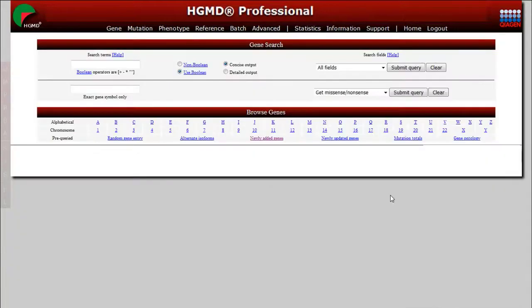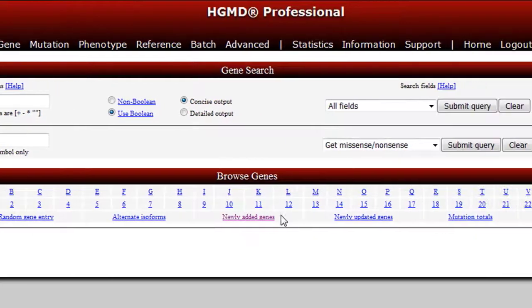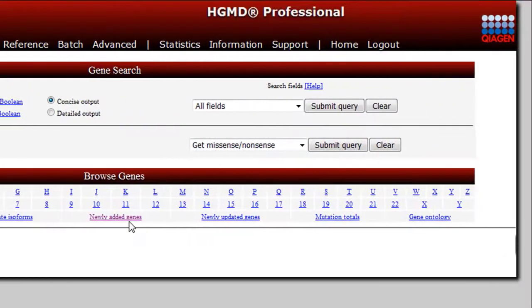Lastly, you can also browse HGMD genes by gene symbol, chromosomal location, or view pre-queried HGMD data including random HGMD gene entries, genes newly added for the current release, genes updated with new mutation data for the current release, genes by total number of mutations, or genes sorted by ontology term.